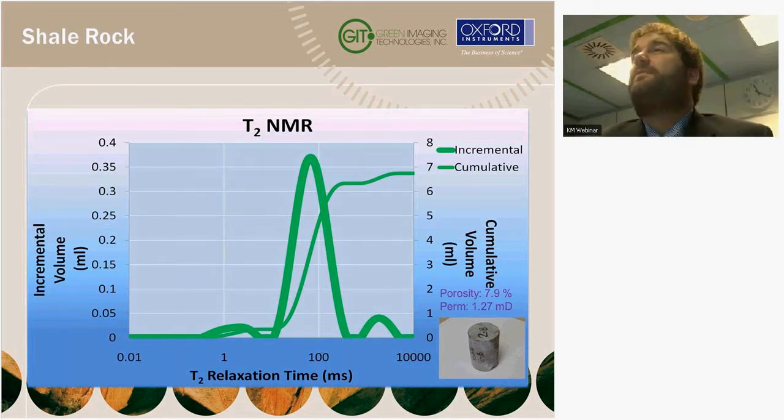We do measurements on different types of rocks. The NMR measurement works in almost all types of rocks. We have done, and not just us, regular sandstones and carbonates, of course, but shale work is more recent, as are oil sands. Particularly with new equipment, the oil sands are showing some promise because we're able to see some of that heavier oil that we couldn't see in previous generations of equipment.